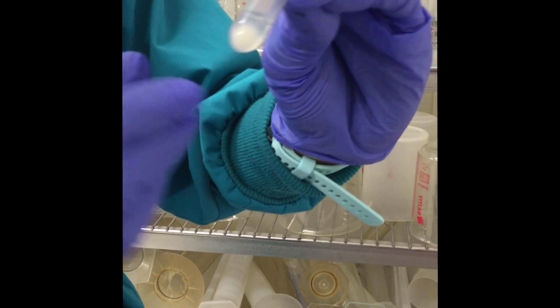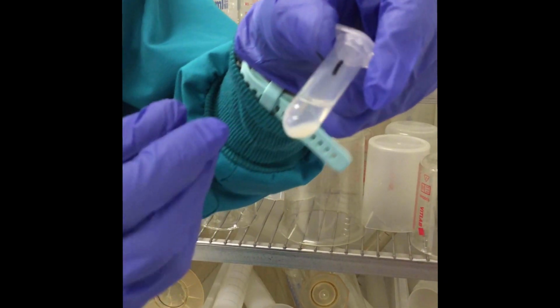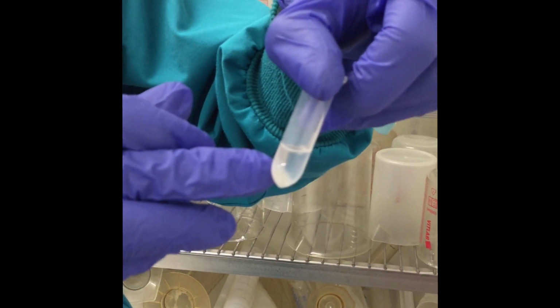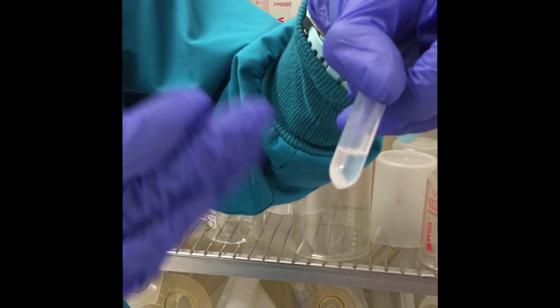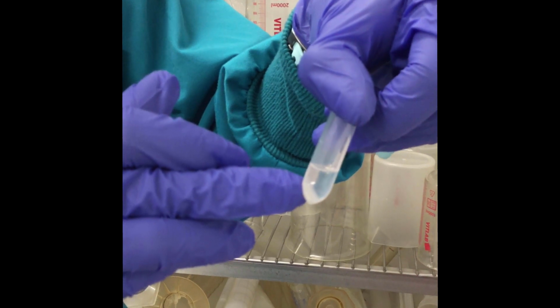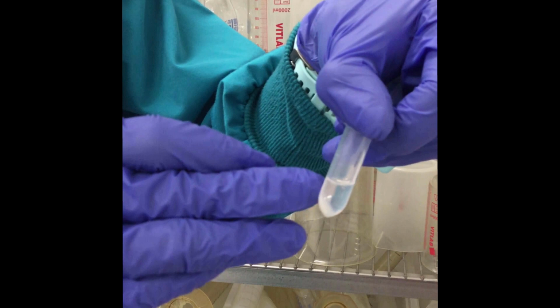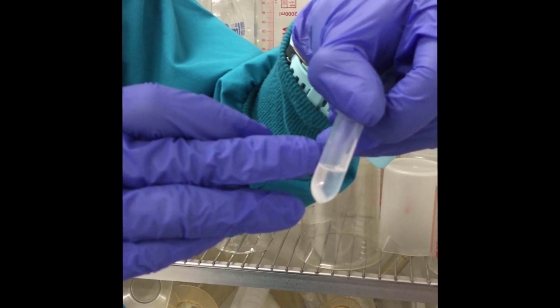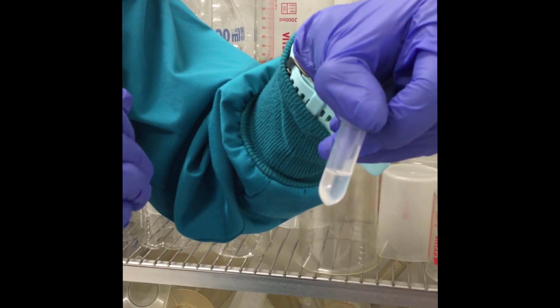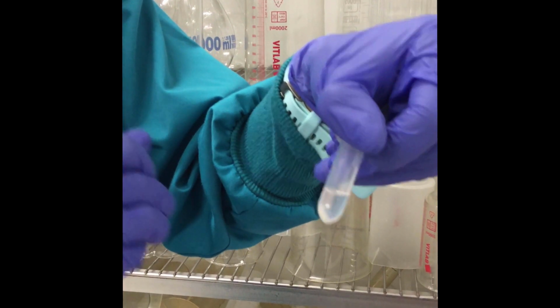You can see that our precipitate is sitting on the bottom quite nicely, and on the top is what we call our supernatant. Now, for this reaction, our supernatant should be clear. If yours isn't clear, you need to repeat these steps again. So the supernatant is the liquid. The supernatant is the liquid on top of the precipitate, yes. And the precipitate is also known sometimes as the pellet. You might hear that word being used. Correct.